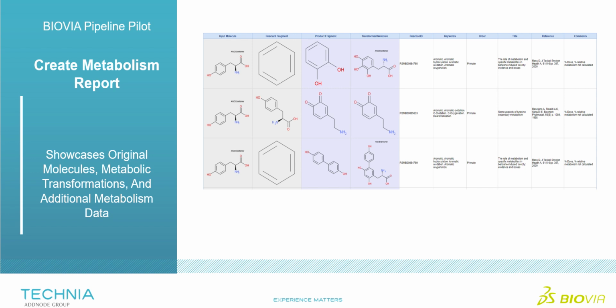Before we delve into the details, let's understand why a metabolism report is crucial. In pharmaceutical research and toxicology, it's essential to document how molecules transform in the body. This report provides a clear overview of these transformations and other relevant metabolism data.